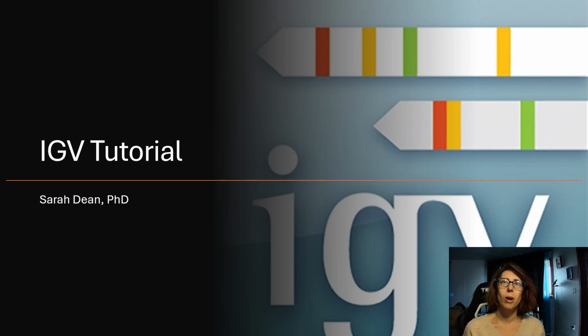In the previous video, I went over how to distinguish sequencing artifacts from true variants, but I focused on single nucleotide polymorphisms and small indels. In this video, we will look at structural variants and discuss how to interpret them using IGV.